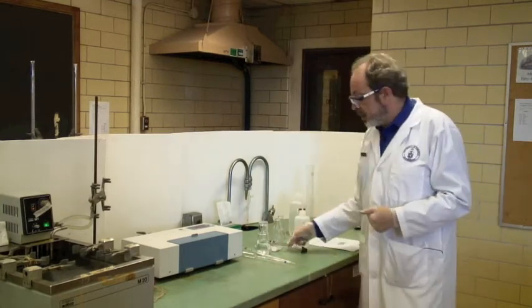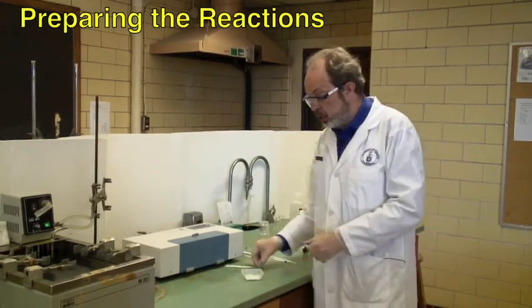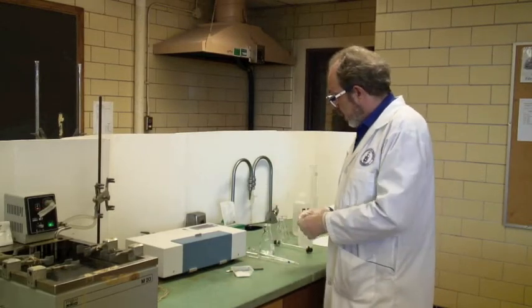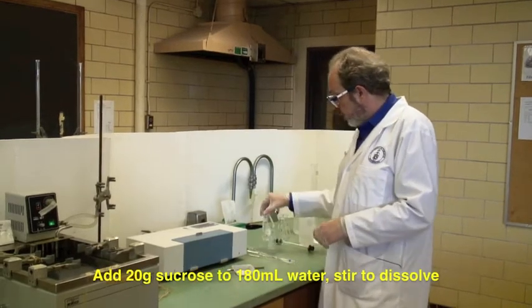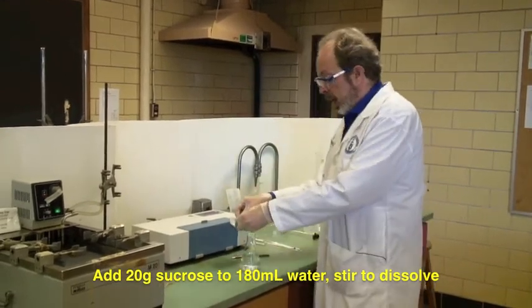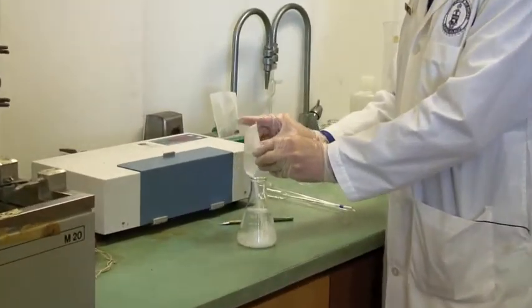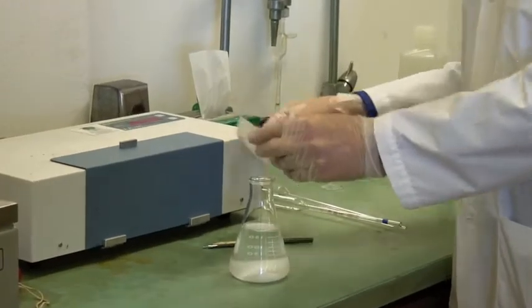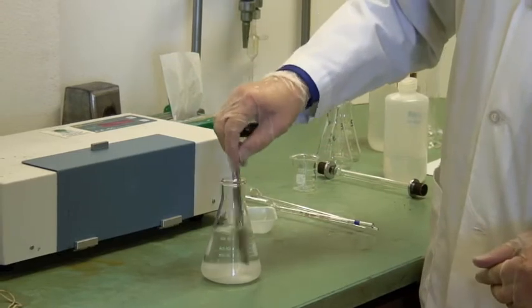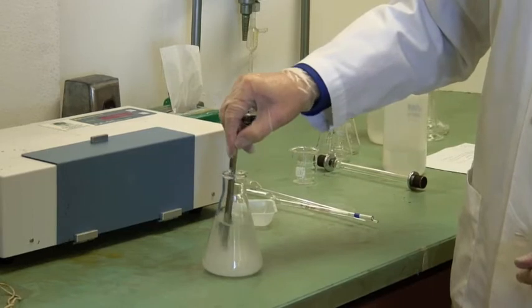The reactant today is just plain table sugar. You'll need to weigh out about 20 grams of it and place it in water, about 180 mils of it, and add the sugar to it. This is going to make a syrup. It doesn't really matter if you get it all there or not, you're going to be measuring it later on. Let's stir this up until it's dissolved.